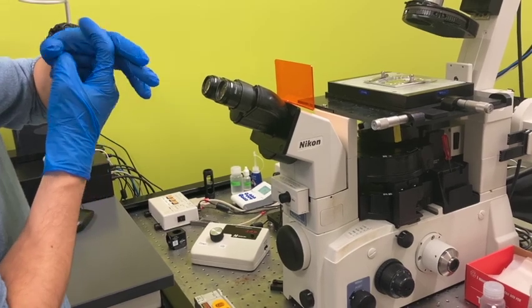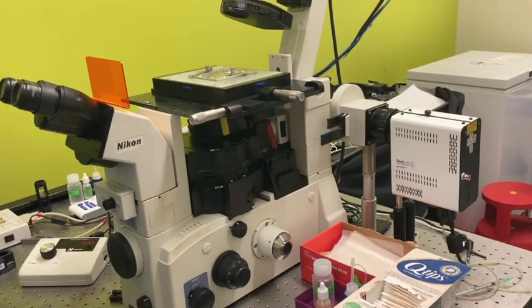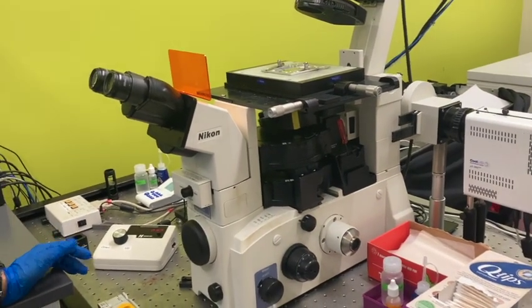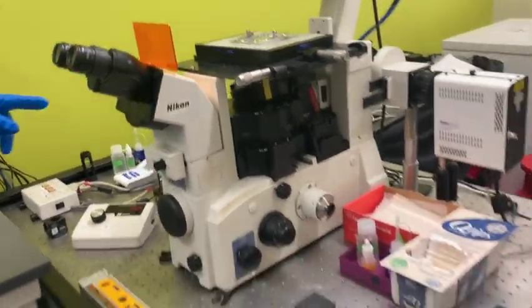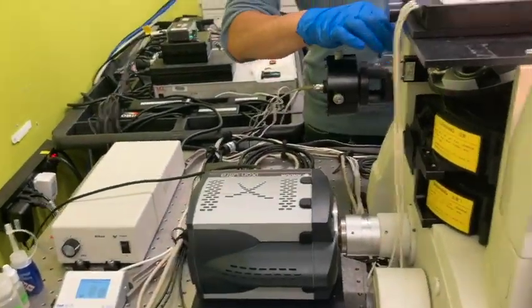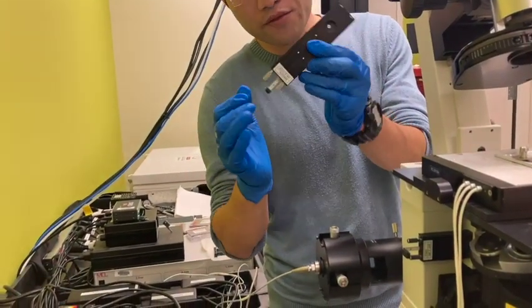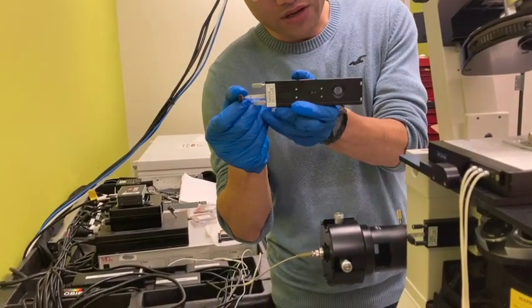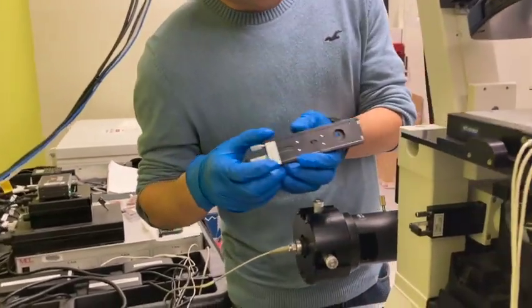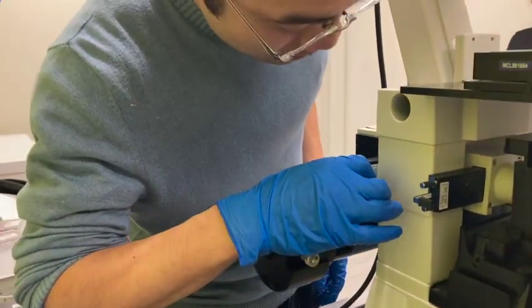So if we start from the IRM here, we have two adjustments. If you go this direction, and I will show it over here, we have an aperture diaphragm, something like this. We can change it wider or smaller, and it's located here. So this one is for aperture.